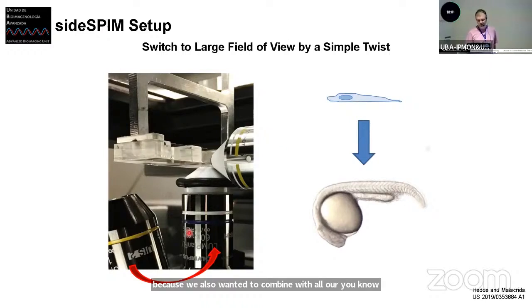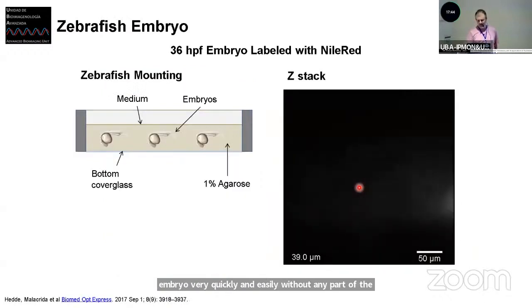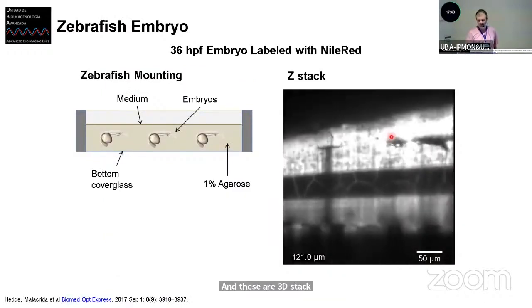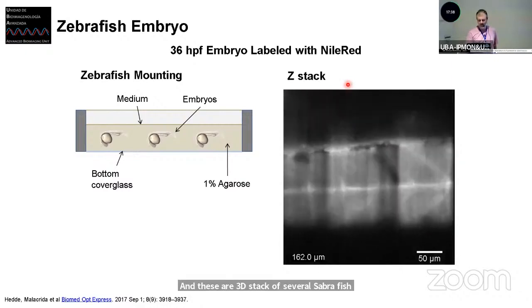And as I mentioned before, the only requirement here was to switch the turret of the objective from one to another. And then we can go from the cell to an embryo very quickly and easily without any further modification of the microscope. And these are 3D stacks of zebrafish labeled with Nile red, which is a dye for labeling membrane.